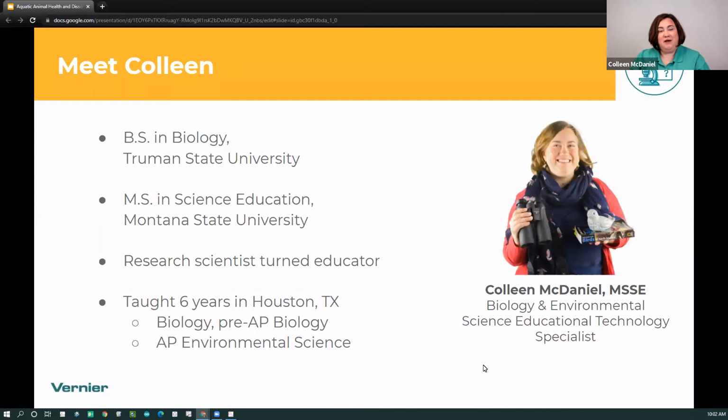Just to start, my name's Colleen McDaniel. I am a biology and environmental science educational technology specialist here at Vernier. What that basically means is I do a lot of things. I do trainings like this, I do webinars. When we were able to be in person, I would do in-person sessions at different schools and go to conferences as well. And when I'm not doing all that, I'm answering any questions that teachers might call in with, problems with sensors or how to do experiments. I also do some research and development of creating new probes, and I also do a lot of writing of different lab activities.